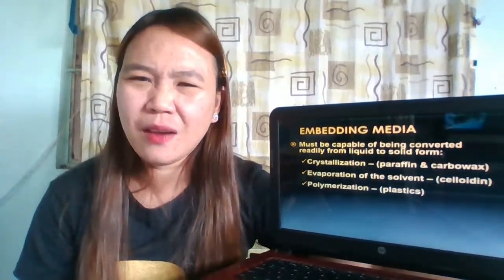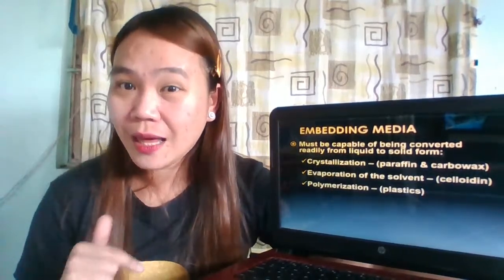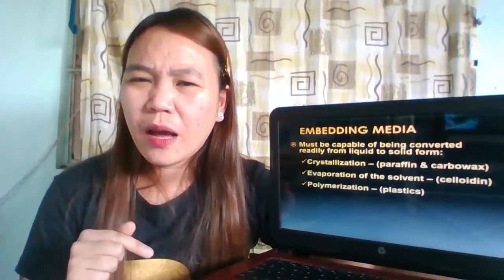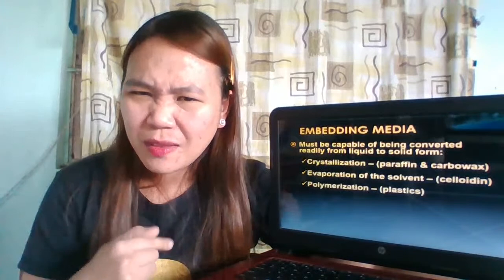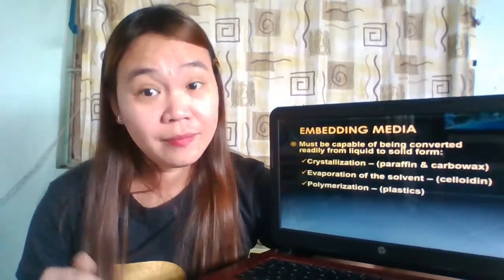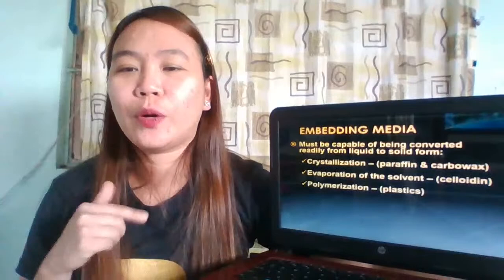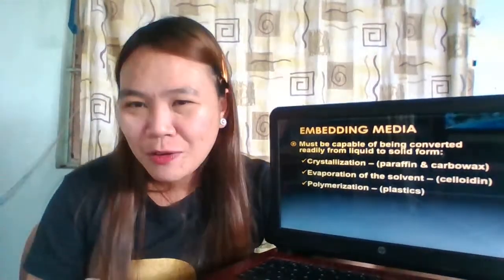How can something infiltrate or impregnate if it is not in liquid form? So that is the importance of the liquid form.